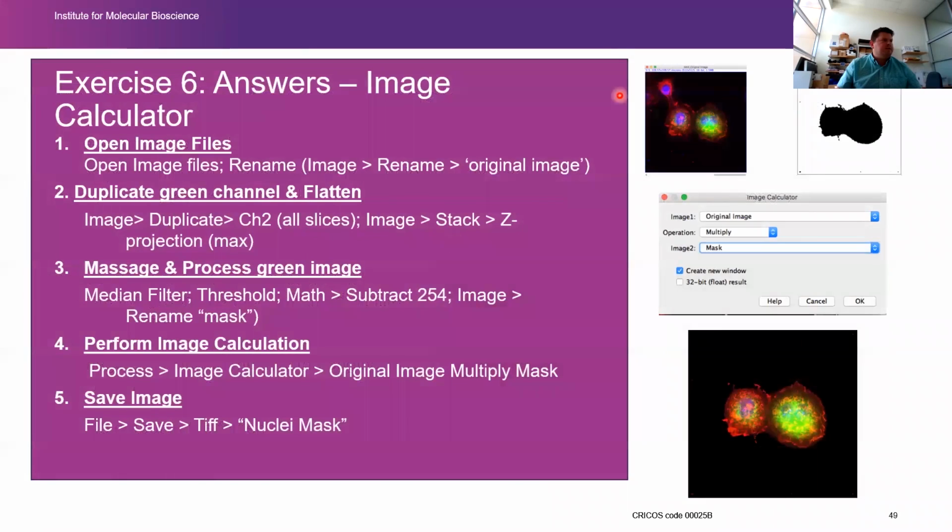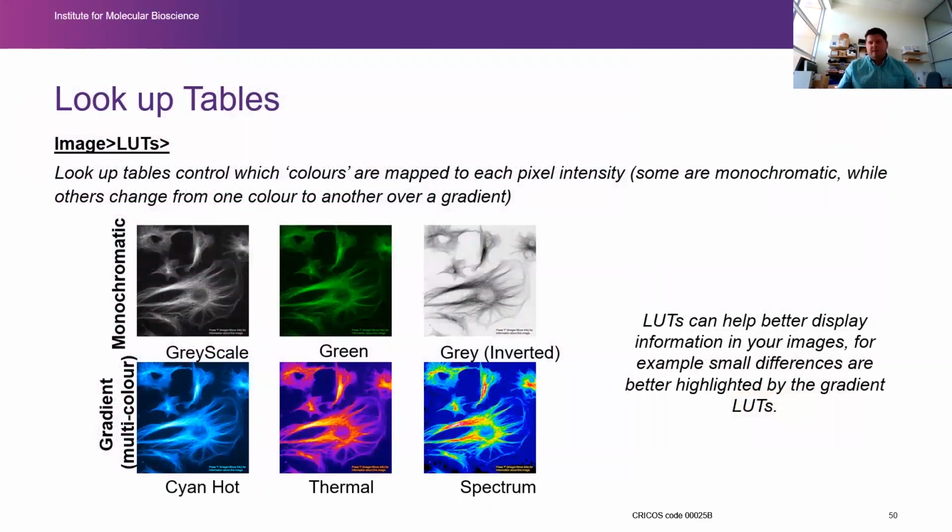So there's the answers for this one, basically showing those steps. And hopefully you can appreciate that now that we're in this segmentation step, we're doing those pre-processing steps all the time, for every example. Now for the next file that we'll work on, it's going to be a FRET analysis.